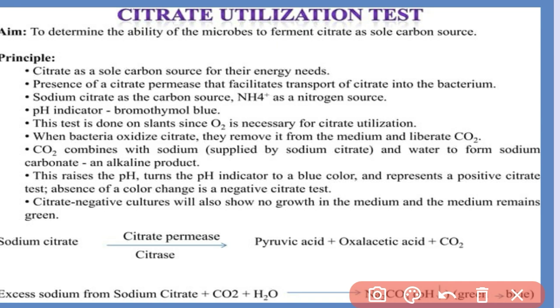This test is done on a slant since oxygen is necessary for citrate utilization. When the bacteria oxidize citrate, they remove it from the medium and liberate CO2. When the CO2 combines with the sodium present in the medium and water, it forms sodium carbonate.